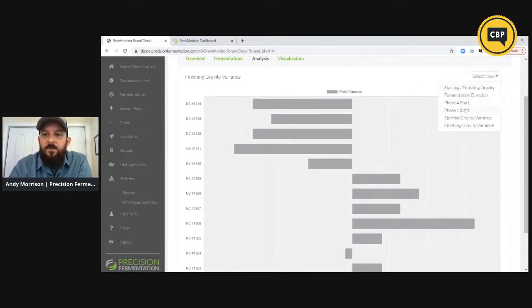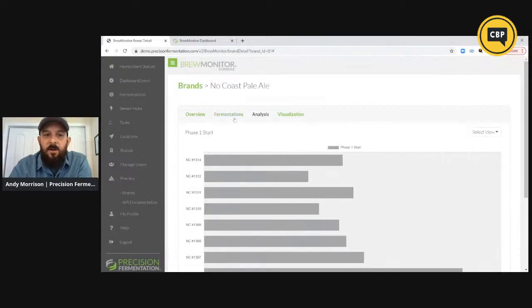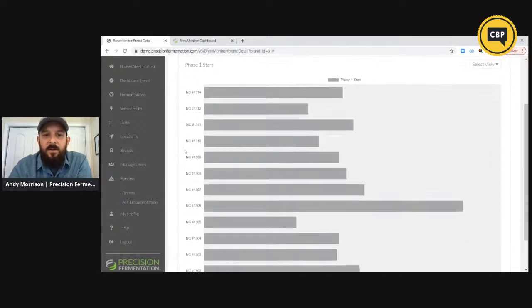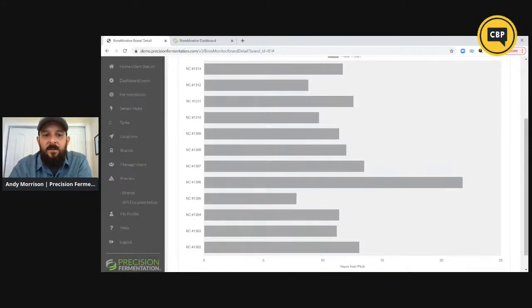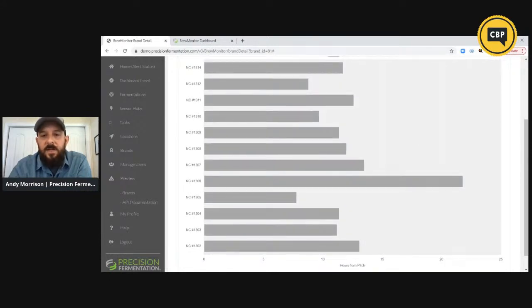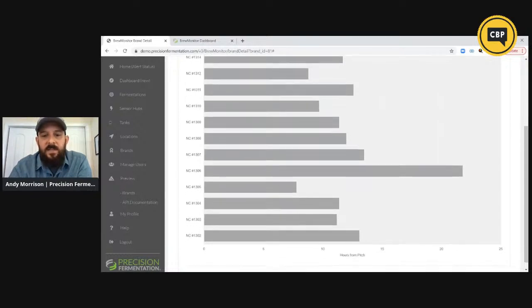And then I'll jump into what this phase 1 and phase 4 starting are. So phase 1 starting is basically how long did your lag phase last before fermentation actually started kicking off? When did active fermentation, when did your exponential phase or your growth phase start? And so we see that here, that I've got a whole range on this brand in particular. So this is a pretty variable thing for me.